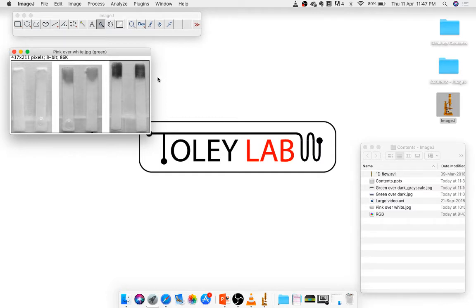So the next thing we do is introduce the concept of an ROI, which is region of interest. A region of interest is nothing but a selection. So it can be a rectangular selection or an oval selection. So we'll start with the rectangle here. And let's say I decide a certain rectangular region on this that I want to analyze. Let's say this. That is because this is where my color is developing.